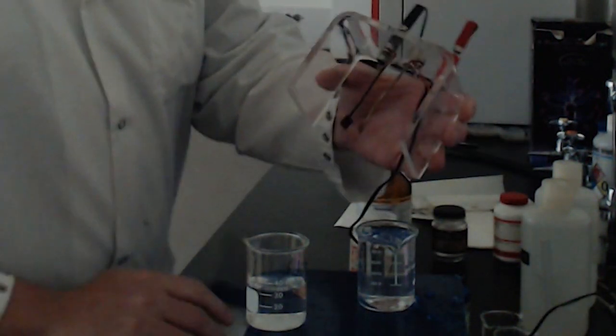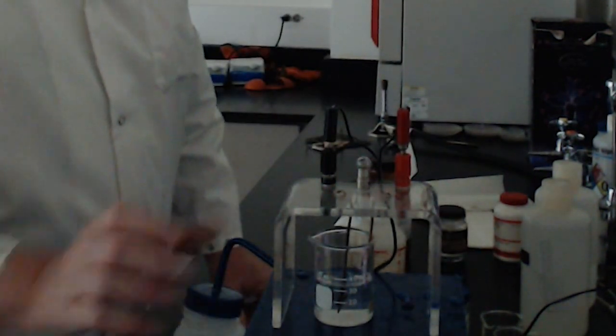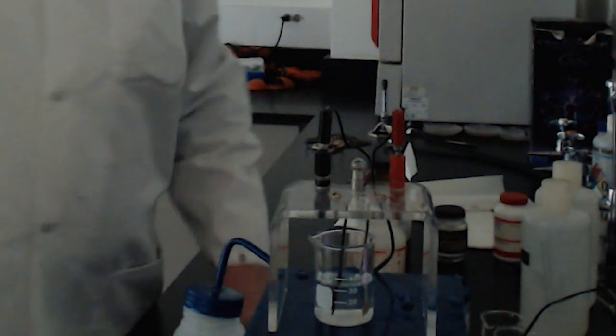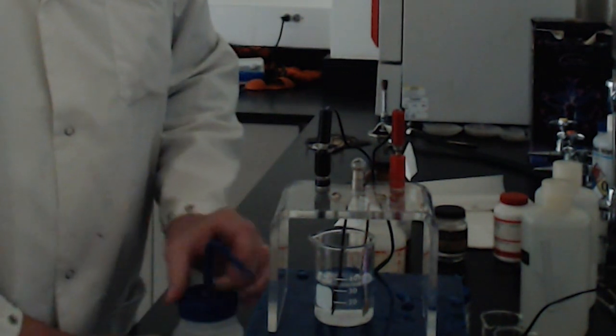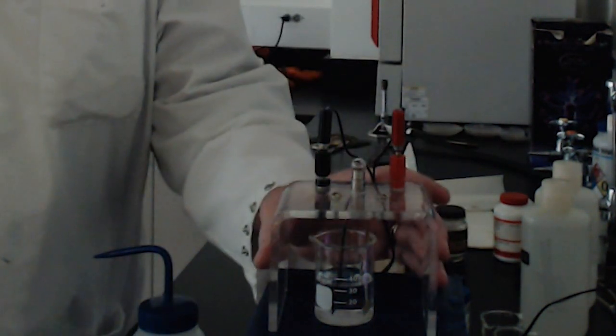Okay. We're going to rinse off the electrodes briefly, and we're going to now try it with the sugar. And we add the sugar and we let it sit and we let it sit, and there is no electricity. So sugar is a molecular substance. It does not break up into ions when it dissolves. It stays as intact molecules. And so we classify all sugars as non-electrolytes.